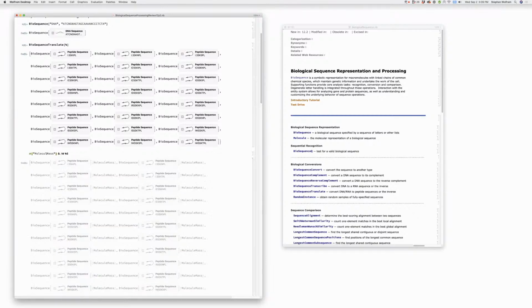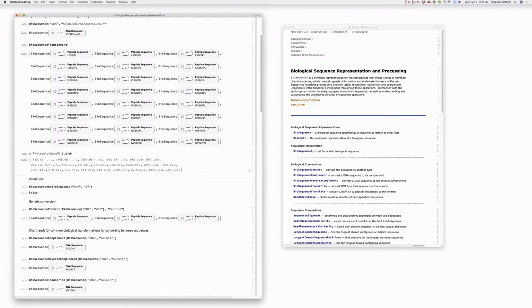God, we still don't have that bug fixed with the selection in the prototype build. Does anybody know what's happened to that? Okay, what the heck is that plus dot? That's probably because we don't know the weight of the stop codon. Yeah, that should just be truncated. That's a bug. Okay, always good that I can find these in less than a minute.